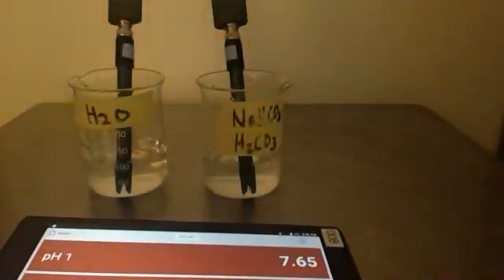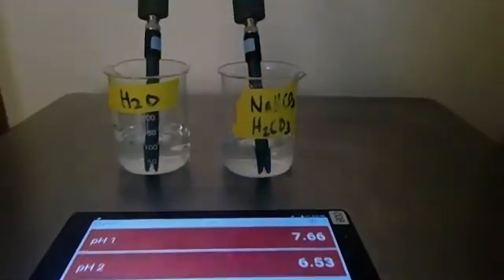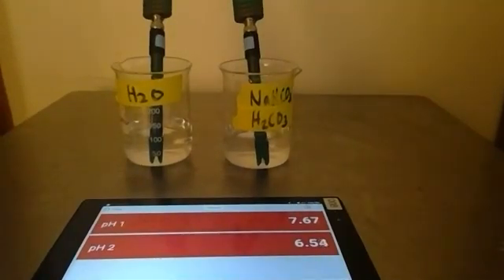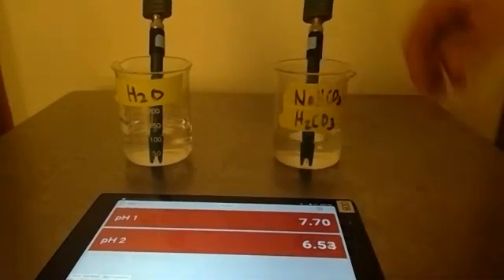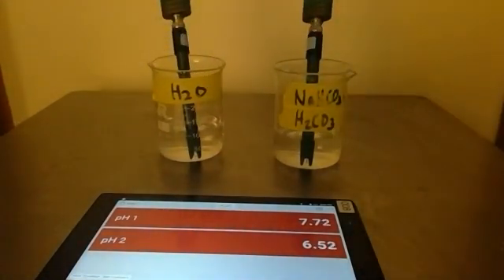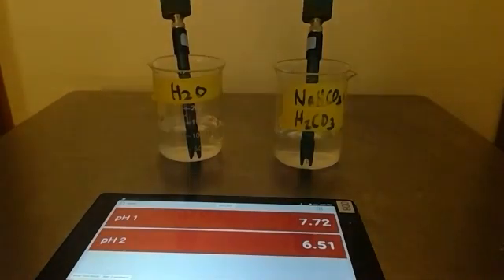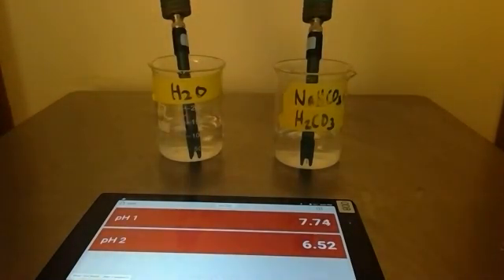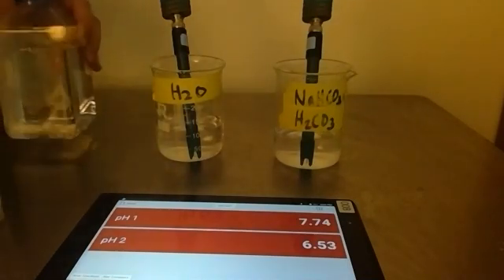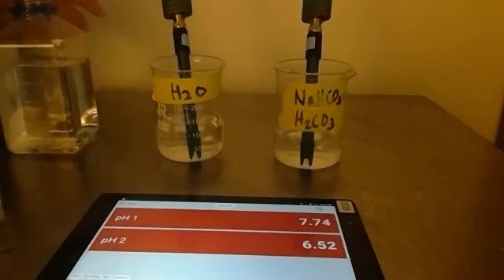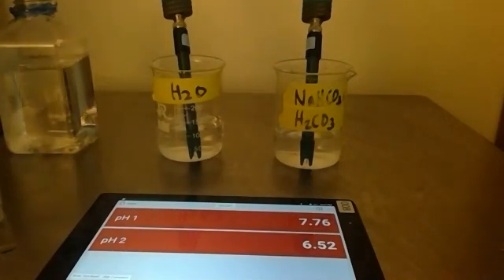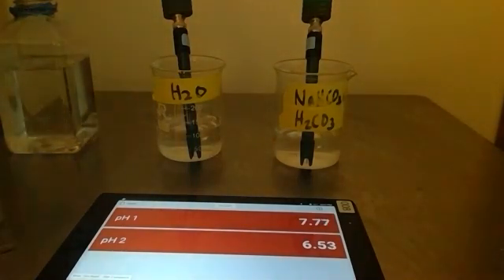We're going to test our buffer solutions and see the change in pH as we add a strong acid. We have our buffer here on the right, plain water on the left. pH sensor one is our buffer solution and pH sensor two is our water. I now have concentrated hydrochloric acid, close to about 1.5 to 2 molar.